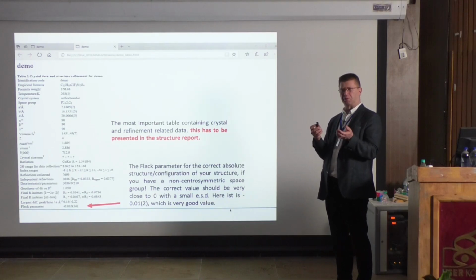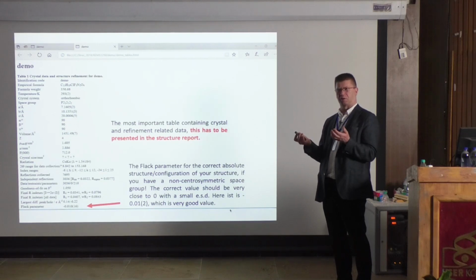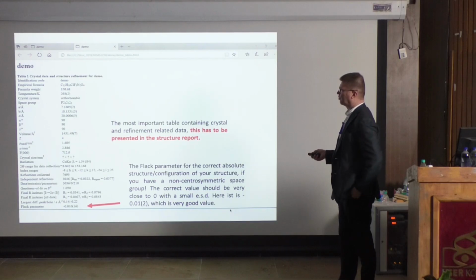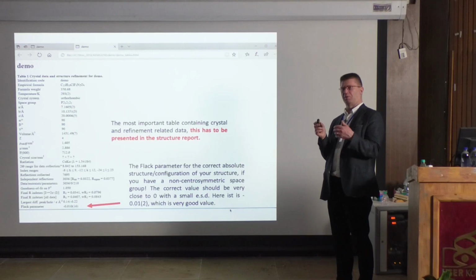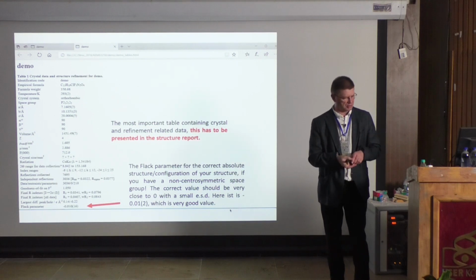But if you dissolve this, you don't see the differences between enantiomers, because in an NMR the enantiomers are the same. You can't see a difference. But in the X-ray diffraction, if it's a pure enantiomer, then there's a difference. And now, this space group here, P212121, is a so-called chiral space group, and there is no mirror image in that space group. And when this is the case, the program automatically makes a calculation. What does this mean actually in real life?